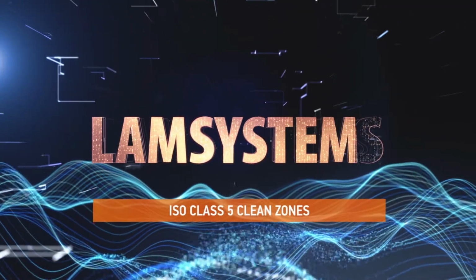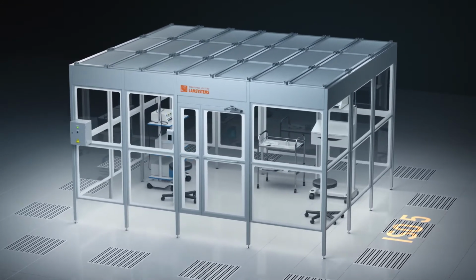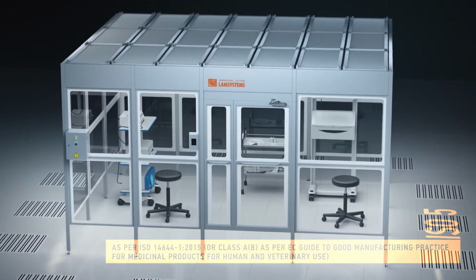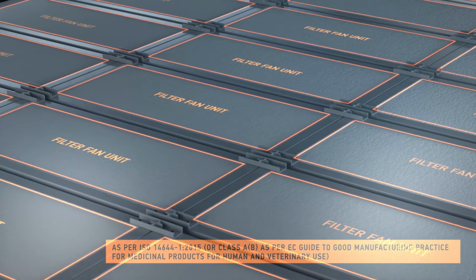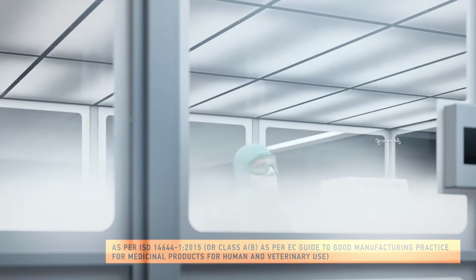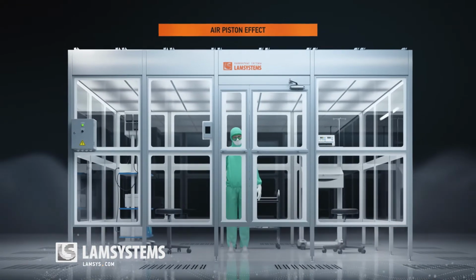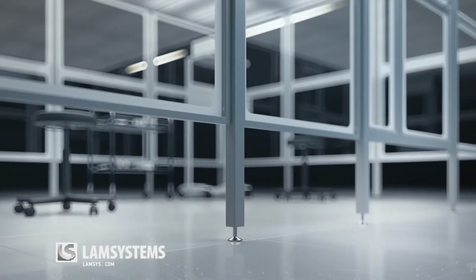Types of zones as per cleanliness class. The major configuration difference of one clean zone from another is its air cleanliness class. For instance, in a clean zone of ISO Class 5, the ceiling is completely made of filter fan units. The cleanliness of the work area is ensured by forcing contamination away with unidirectional clean airflow, referred to as air piston effect. Along the periphery of the zone, there is an enclosing structure elevated above the level of floor to ensure the exhaust of airflow.